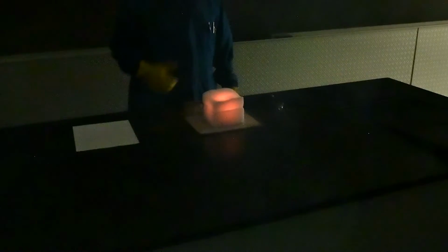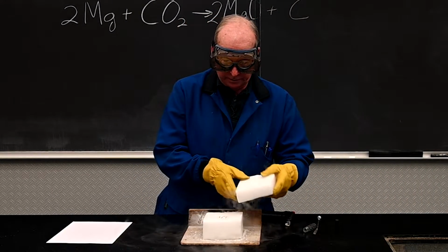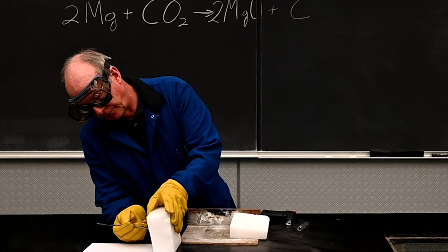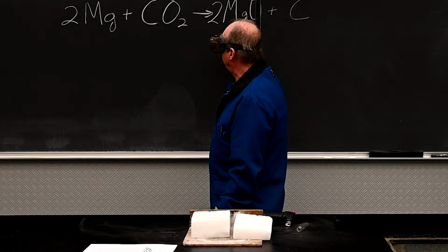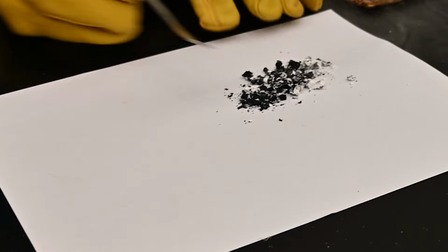And you see that it glows very brilliantly and it illuminates the cube of dry ice, but then it goes out, and the reason is we've used up all the magnesium. So let's bring up the lights. And what do we have left? Well, we've got some white material here on the surface, but you can see once we put a little pressure on it to get it to fall out of there, there is white there, which is going to be the magnesium oxide that we produced from those being combusted together. But observe when we push that down, we got this very black material. Where did that come from?